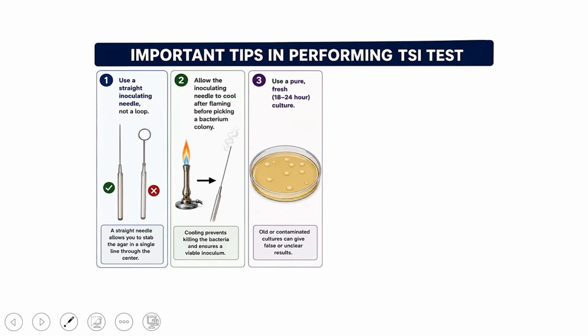3. Use a pure and a fresh culture. And this is bacterial cells grown in the lab within 18 to 24 hours. What you have to note is that using an old or contaminated culture can give a false or unclear result.